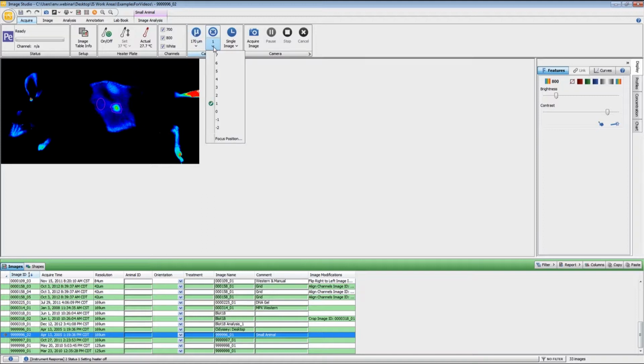The focal offset will be determined empirically. So at the beginning of your project, when you're doing your pilot study, you will want to determine what the focal offset will be and then leave that set at the same point for all of your imaging.